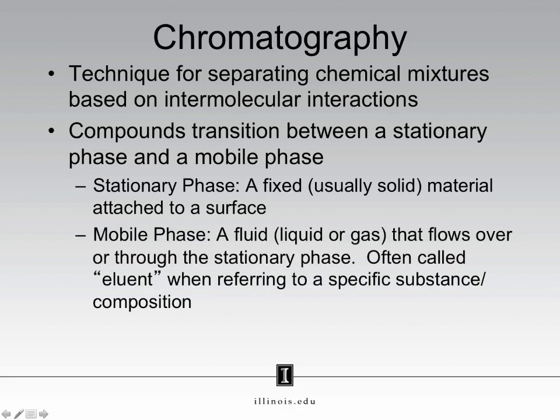The mobile phase, again as the name suggests, is a moving phase, which is a fluid, either a liquid or a gas, that flows over or through the non-moving stationary phase. Oftentimes, this mobile phase is called the eluent when referring to a specific substance or composition.